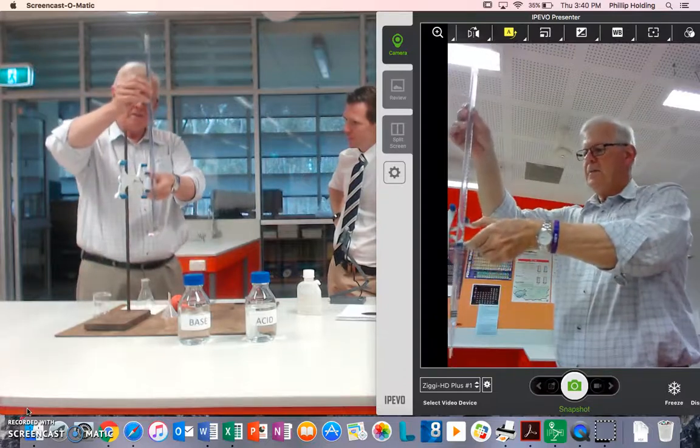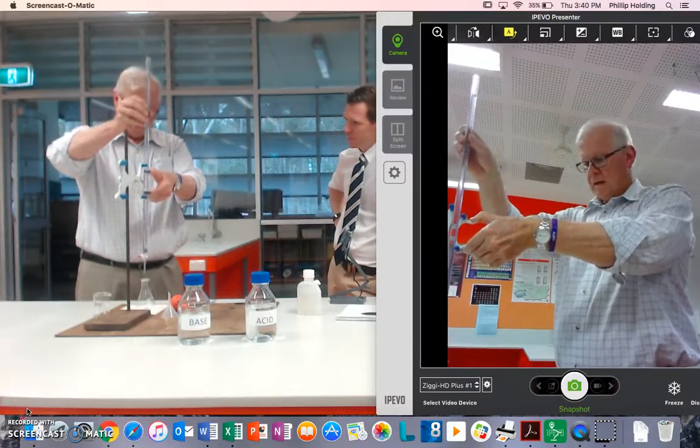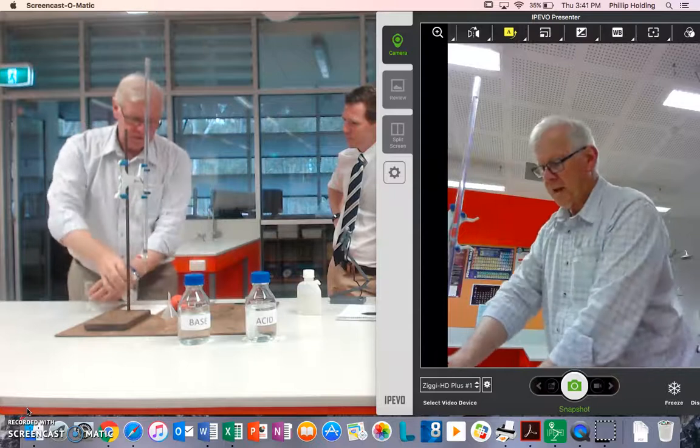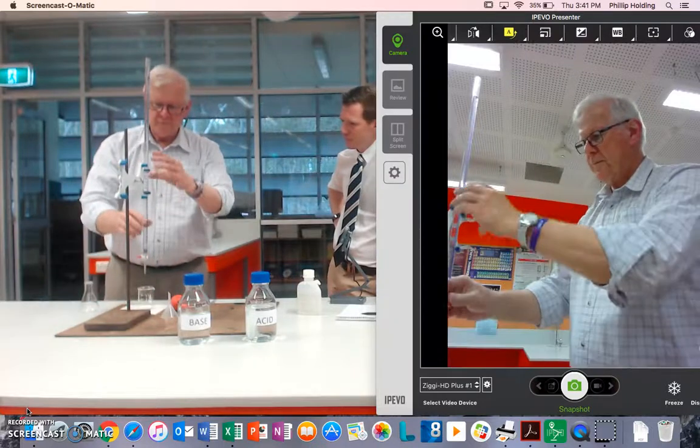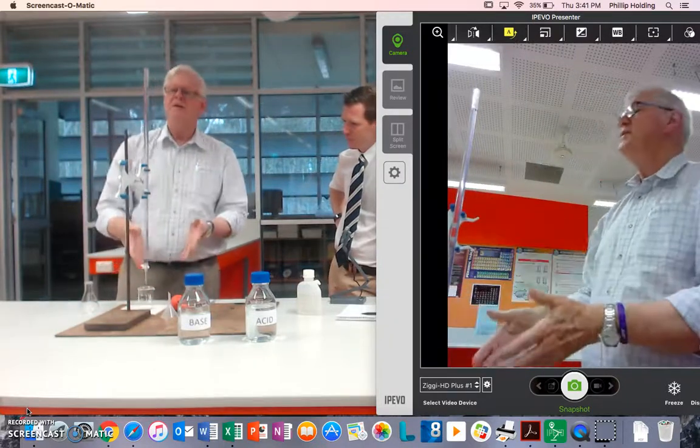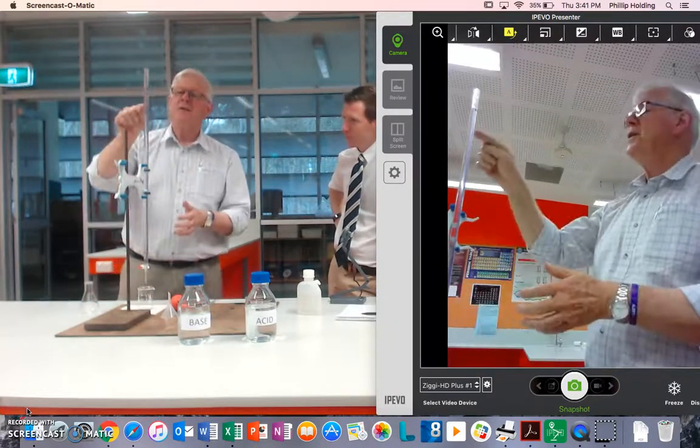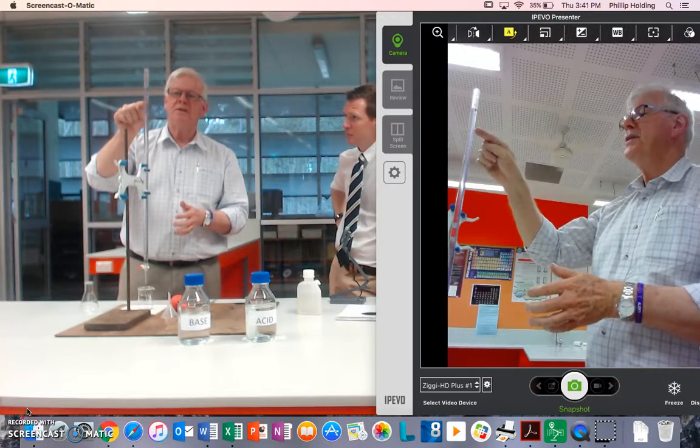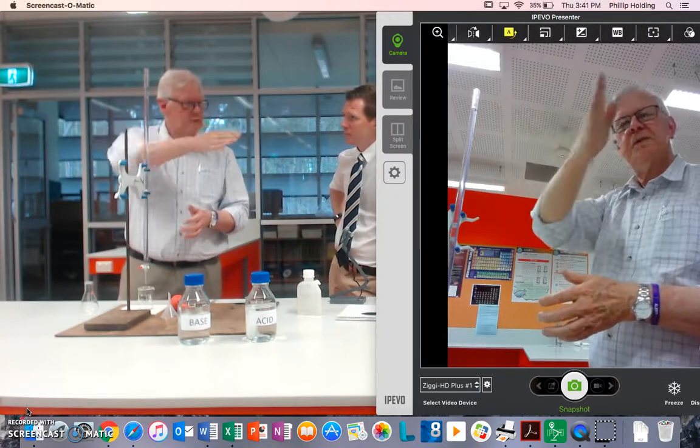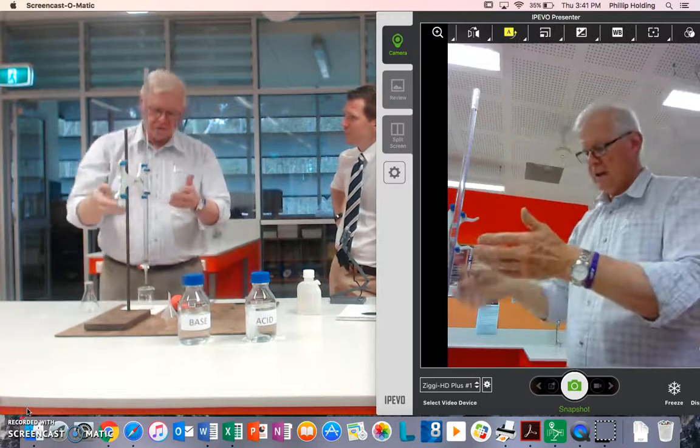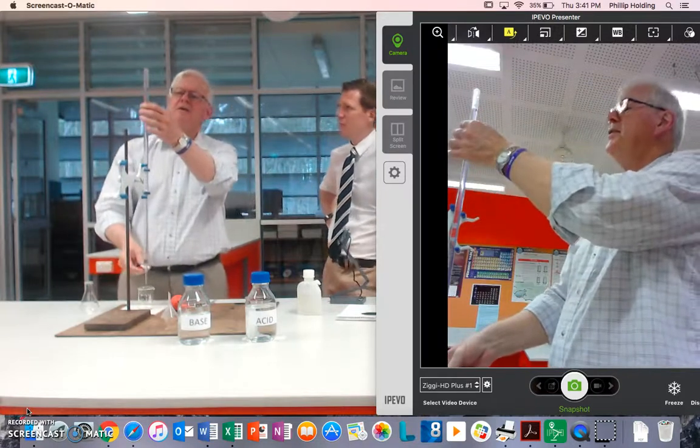We clamp it in position. Get comfortable. Now, staying with the beaker with the base, I'm going to bring this down such that meniscus, which is that curved bit at the top, has got to sit on the line. Now, the most convenient line to start on is zero.